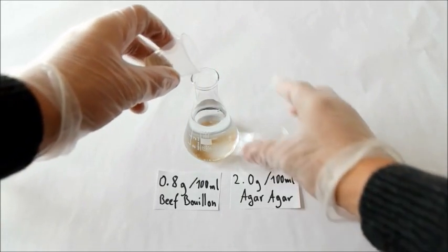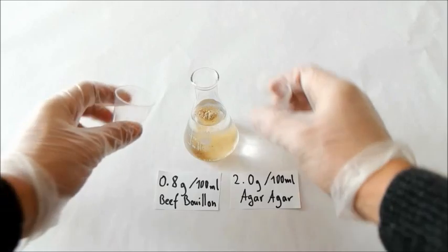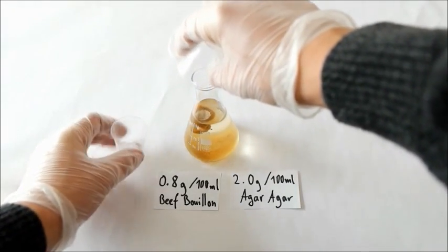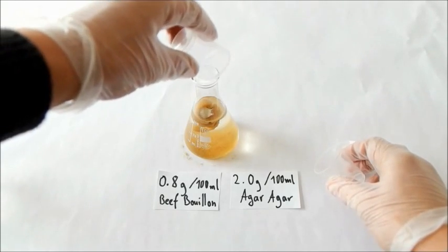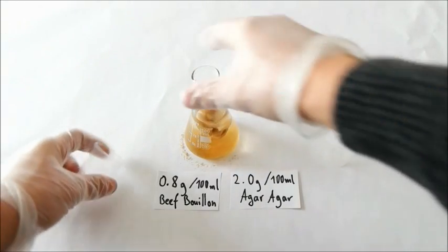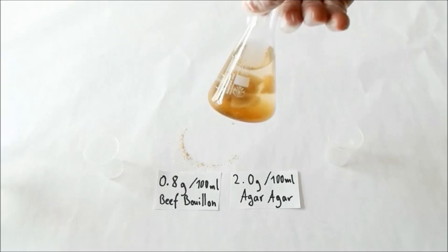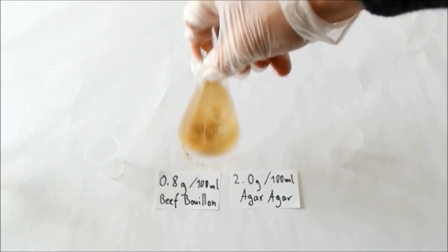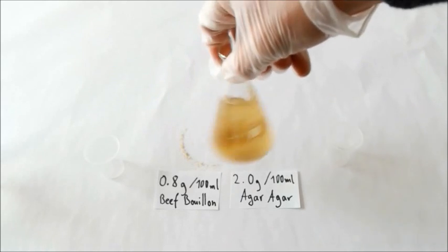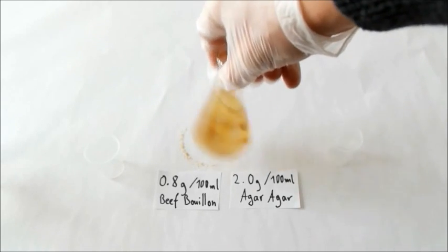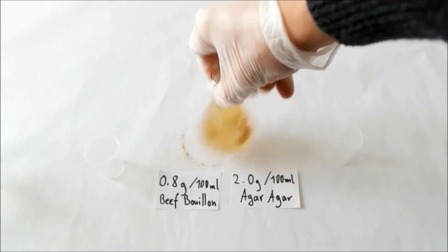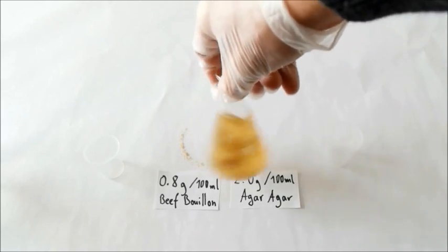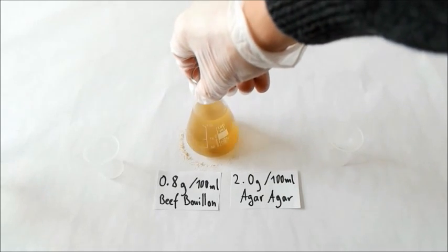So now put your two ingredients in your Erlenmeyer flask and then shake it. Shake it to let it dissolve. If there are little things which don't dissolve this is no problem because later on when we are cooking it they will dissolve automatically. So you can just let it like this and go on with the next step.